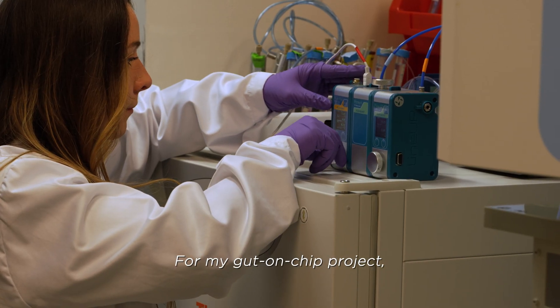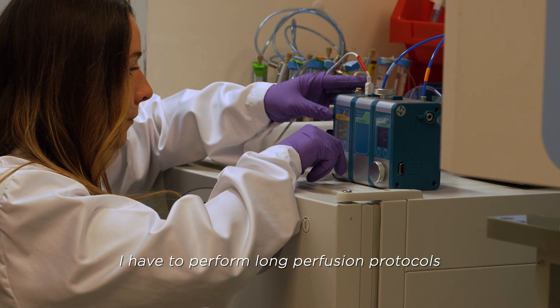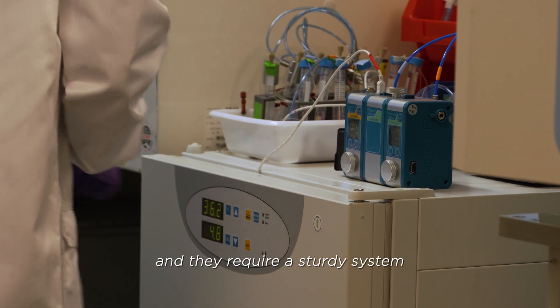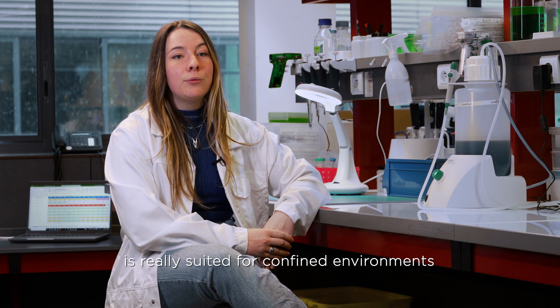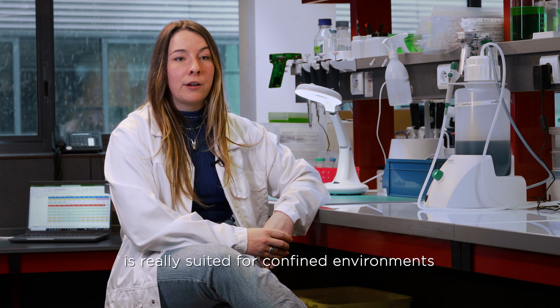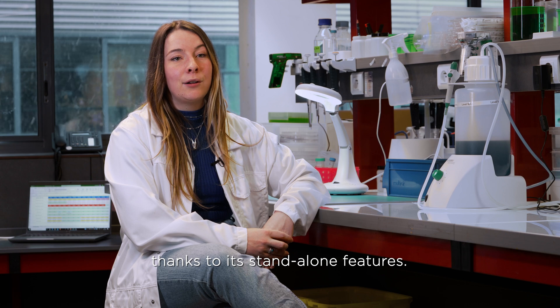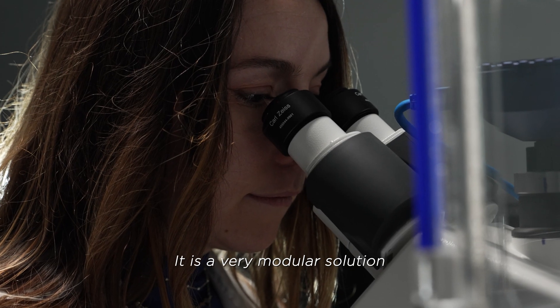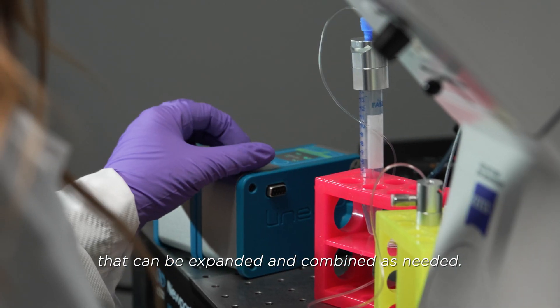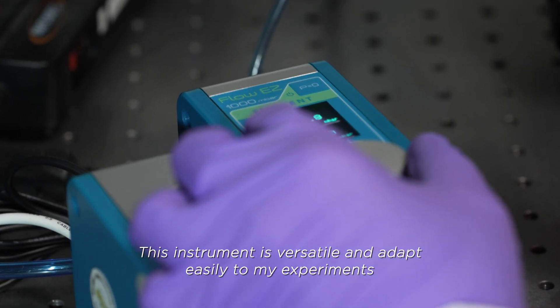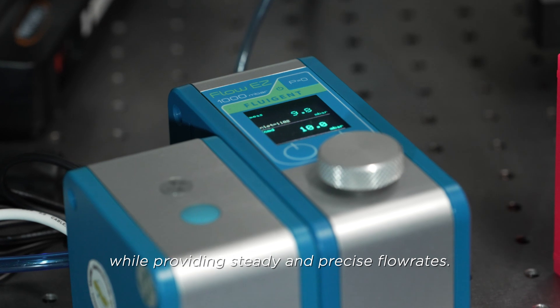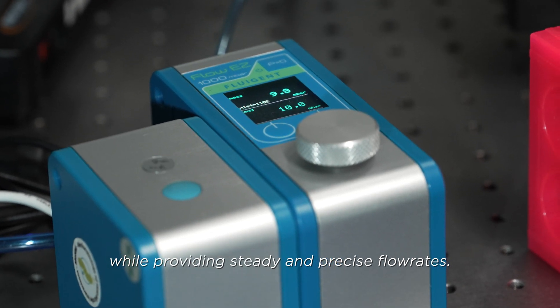For my gut-on-chip project, I have to perform long perfusion protocols and they require a sturdy system that can fit inside small culture rooms. The FlowEasy by Fluigent is really fitted for confined environments thanks to its standalone features. It is a very modular solution that can be expanded and combined as needed. This instrument is versatile and adapts easily to my experiment while providing a steady and precise flow rate.